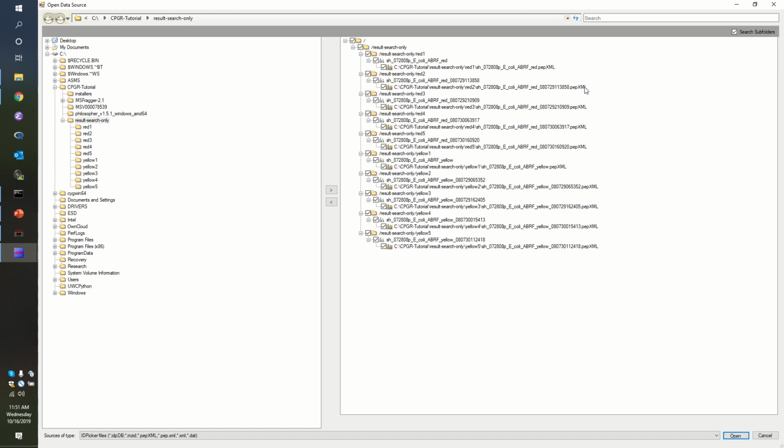Yes, sir? The result directory, did you create it? It was created when FragPipe ran. Because I ran FragPipe and it crashed, and it worked now. Oh, it works now. That's good. Okay, where did you tell it to save the results? Oh, okay. You found the results? Yeah, no, it's fine. I'm being stupid. Oh, no worries. Maybe I think its default location is My Documents. No, I saved it in a file called run. Okay. Great. Well, if you can find them, that's wonderful.